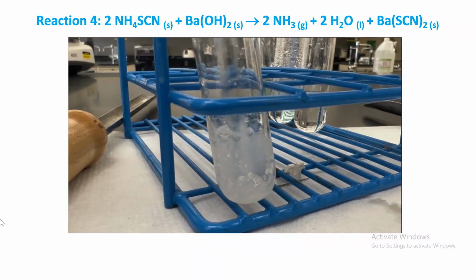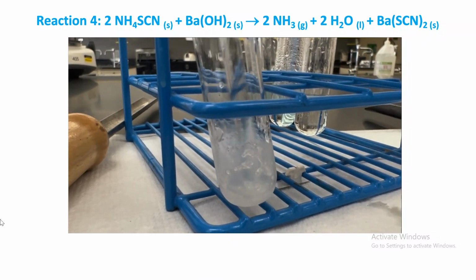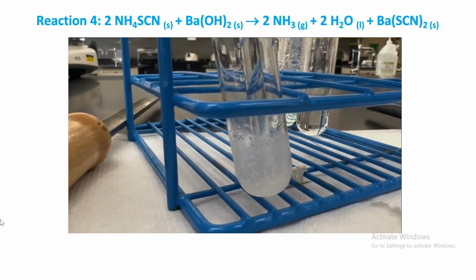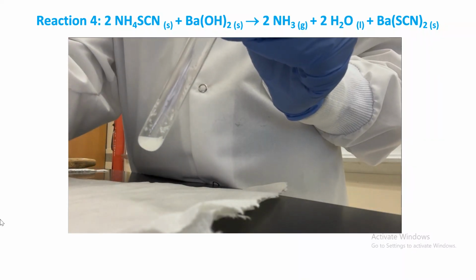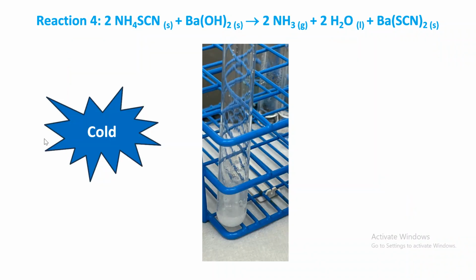and this heat is going to melt the two solids. Now, one of the solids, as you saw earlier, said it was a hydrate. Hydrate means it has some water in it. So see, this is enough water that will get the reaction to start. Liquids react faster than solids. All right, so here it is. Now, it was not like the other reactions, which was very evident, but nonetheless, you can see there is a white solid here, and it's very cold. This reaction could also serve as a cold pack. So for reaction 4, everyone, you're going to say this was an endothermic reaction.